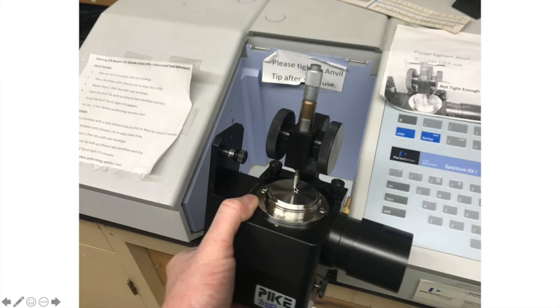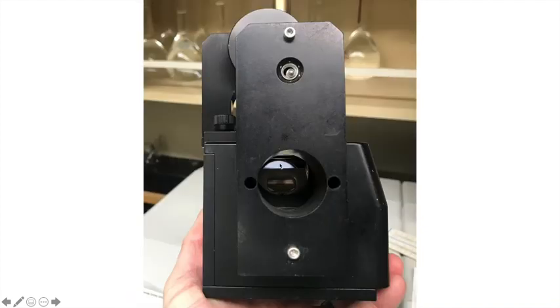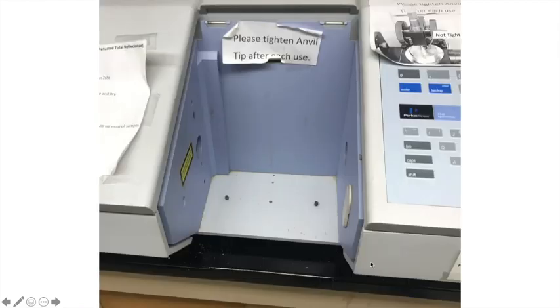I did it two ways. I ran it on the zinc selenide crystal with the ATR adapter like always. But I also took out this zinc selenide crystal. Remember I was telling you there's a mirror that the infrared light hits and it bounces up into the zinc selenide crystal and comes out. This is the other side. And it comes back down out of this. It's this mirror goes to the detector. So yeah, I took that out. So here's the compartment without the ATR adapter.